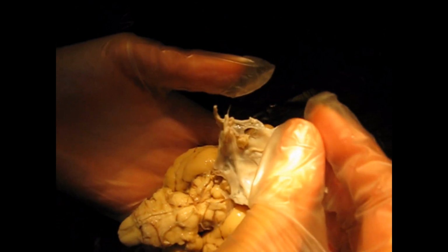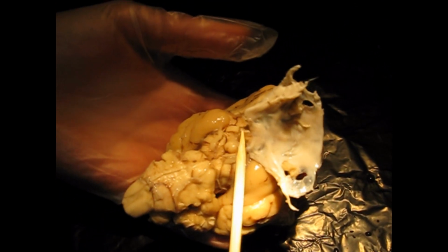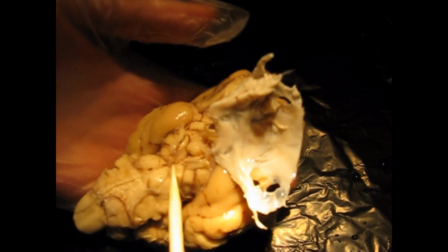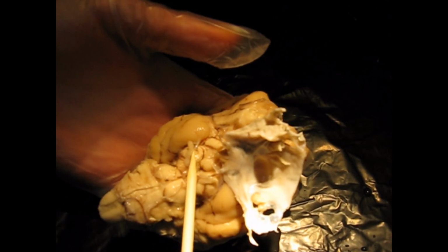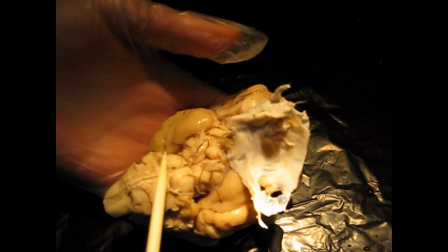So I'm just going to flip it over really quick so we can keep the pituitary gland. Okay, just posterior to the pituitary gland, which is right here, you're going to see the mammillary bodies, and they're largely in control of olfactory relay. Remember, they're connected to the fornix, which is part of the limbic system. Okay, these are cranial nerves here. There's a few more down this way.